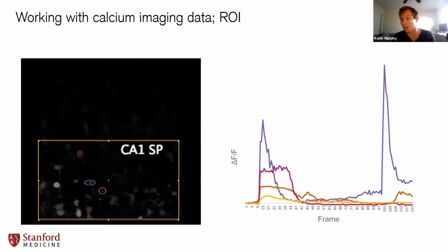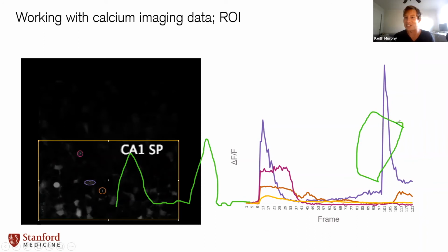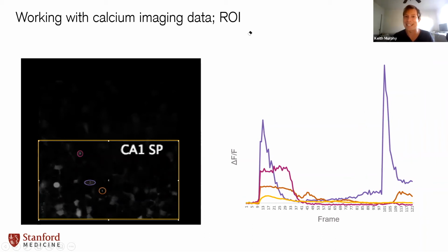Also, Kim, you're saying something really awesome that I'd like to point out. We don't have a very long baseline here because Jamie just didn't give us a long enough video. But if we had drawn this line out very far, if we had more video, we might start to see some random sort of spikes. In which case, then we could determine if this spike over here is stochastic or statistically a real effect relative to our ultrasound here. And Kim is a scientist, so I'm glad she brought that up. It's like a team of scientists thinking together here.